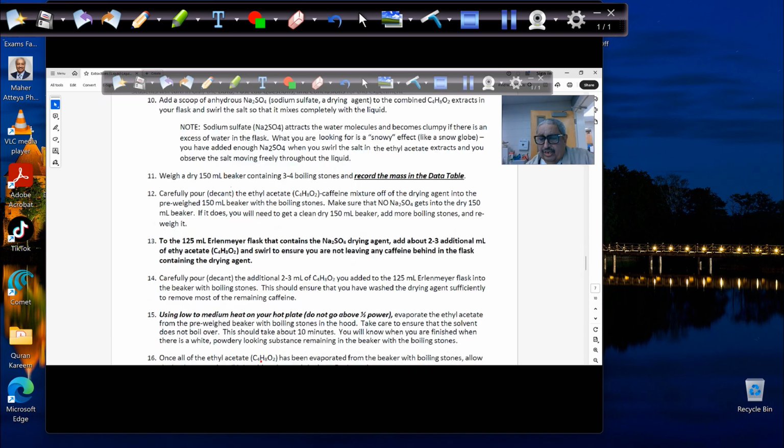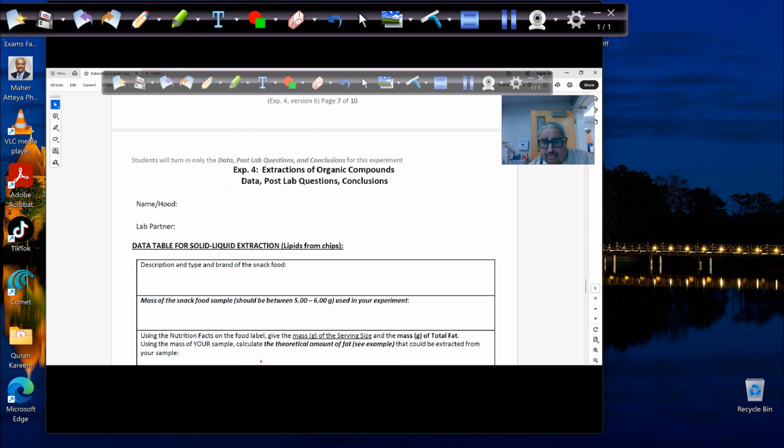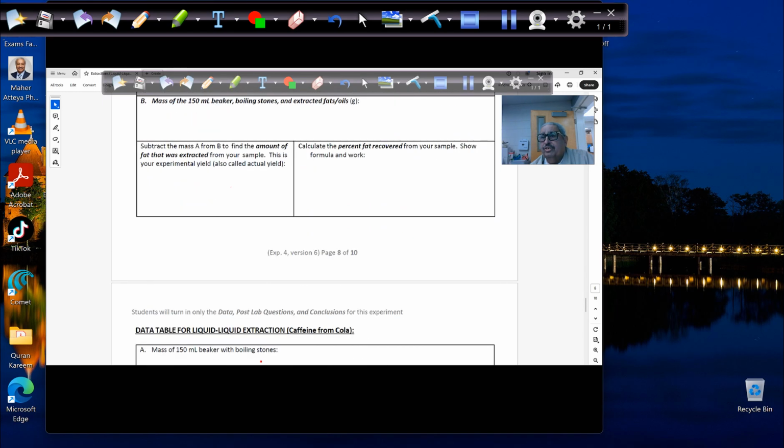As I said, make sure that whenever it's heating, you do not overheat. In both procedures, avoid overheating. Overheating will destroy your yield and can cause harm to your body. If something spills over and jumps onto your body, that's not good. Those are hot liquids of the solvent, which is hexane in the solid-liquid extraction, and ethyl acetate in the liquid extraction.